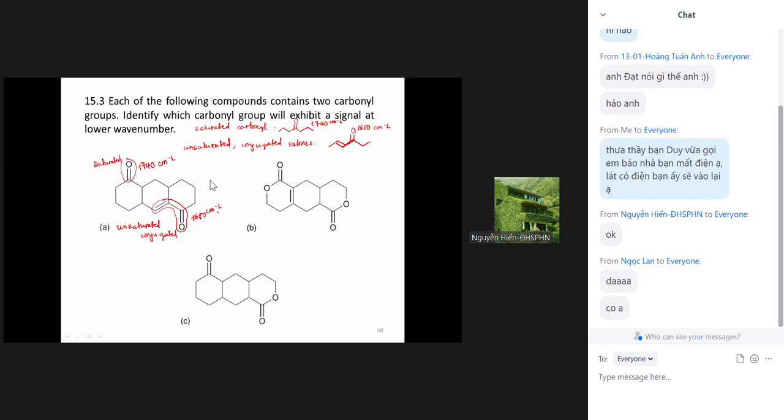So if you take this compound and put it in between two potassium bromide salt plates, and you radiate the sample with infrared light, then you get a spectrum in which you see two different signals corresponding to two different kinds of carbonyl groups. One is saturated and the other is unsaturated and conjugated carbonyl functional group. Okay.